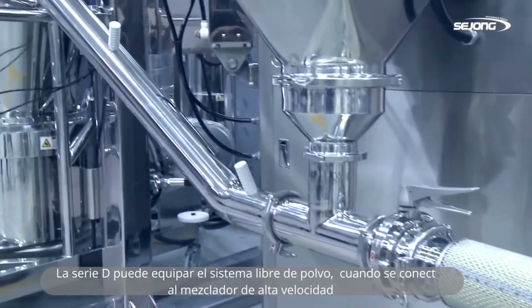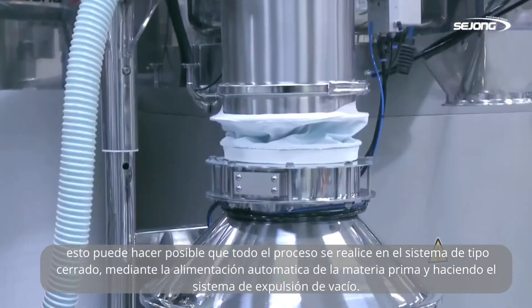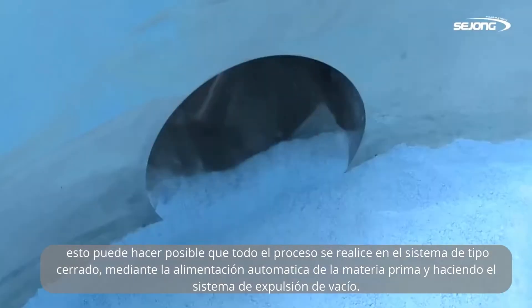D-Series can equip the dust-free system when linked to the high-speed mixer. This makes it possible for all processes to be done in a closed-type system by feeding raw material automatically and making up the vacuum ejecting system.